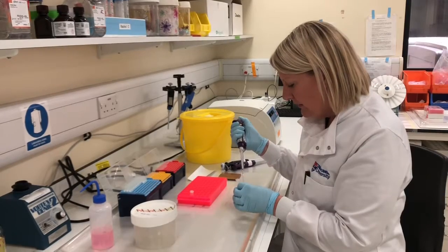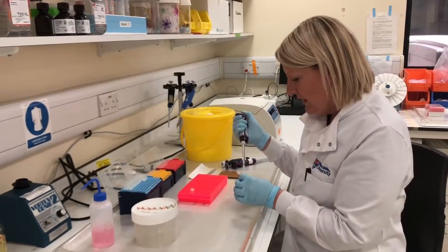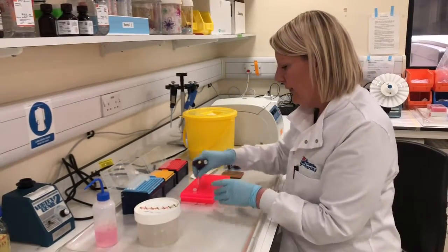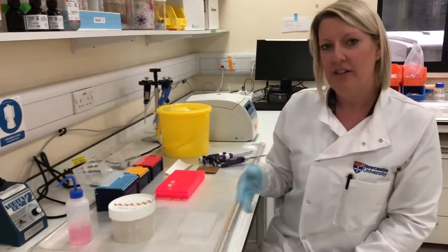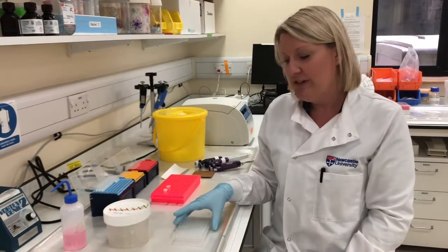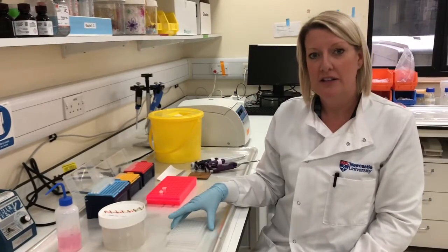And when the real-time PCR machine carries out the real-time PCR, what it does is it heats the plate up. Inside the machine there's a metal plate you'll see in a minute. We sit this plate in it, and it cycles through various temperatures, and that amplifies the DNA in the area of interest of the gene we want to look at, and then we get a readout from the machine to tell us what's going on.